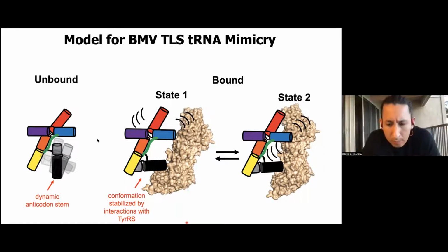There was a question about how you chose the tilt to use for that data collection. I don't recall the name of a little program that we used. It just escaped me right now, but I'm sure that you can look it up. There is a little script that you can run on your reconstruction that tries to find the optimal angle, and I think it even tells you the proportions of data that you should take.